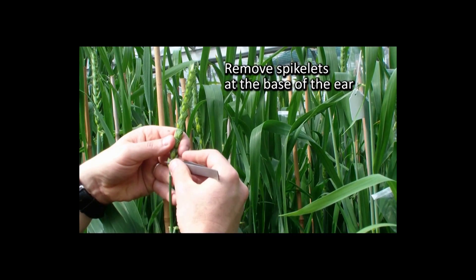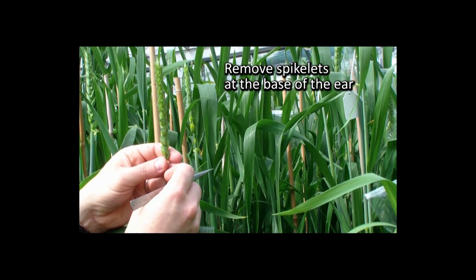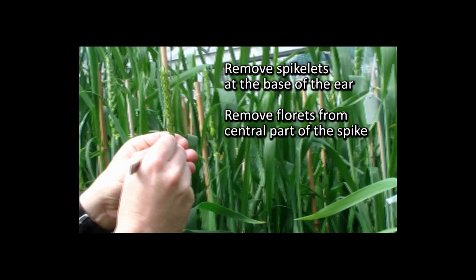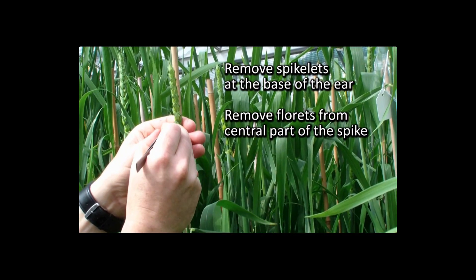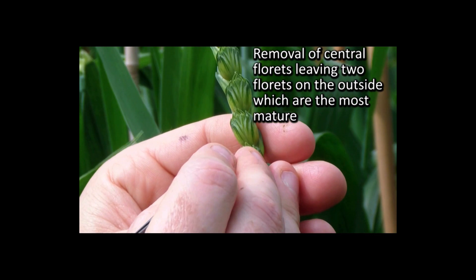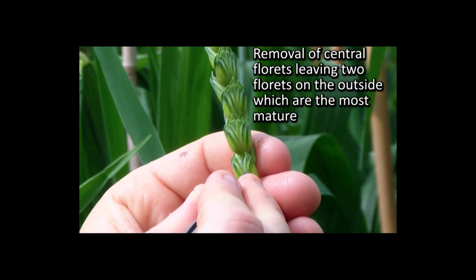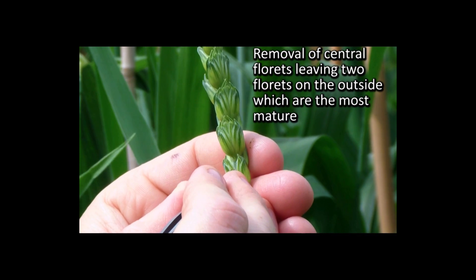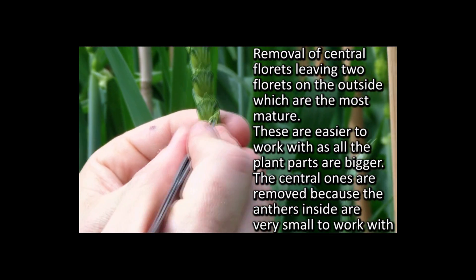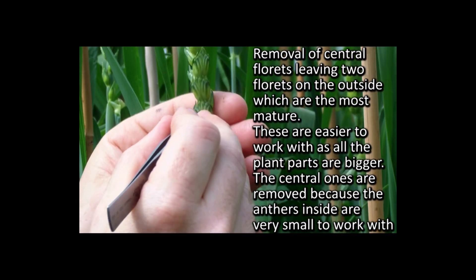To begin with, we first remove spikelets at the base of the ear and we also remove florets from the central parts of the spike. Removal of these central florets leaves two florets on the outside which are the most mature. These are easy to work with because all the plant parts are a little bigger. The central ones are removed because the anthers inside are very small to work with.